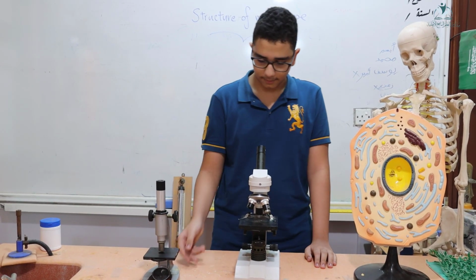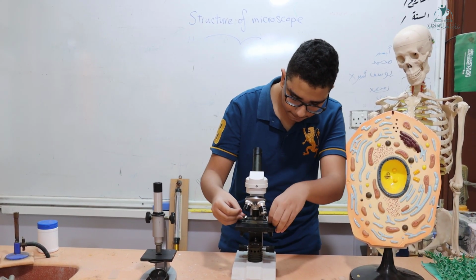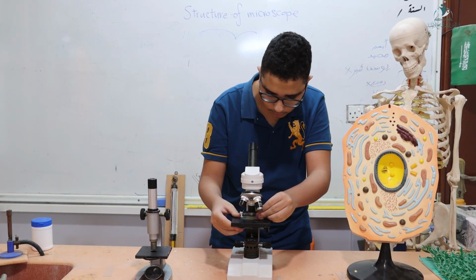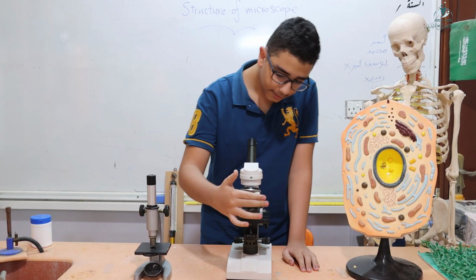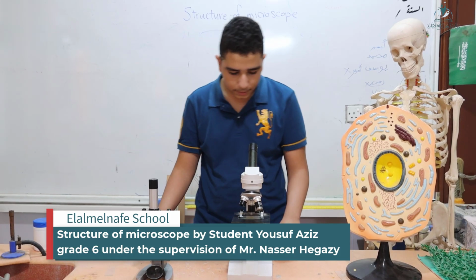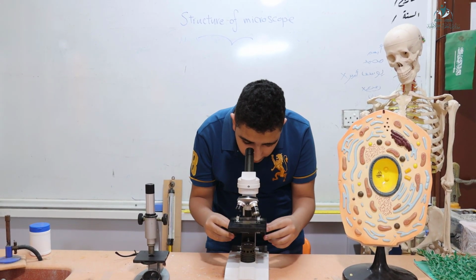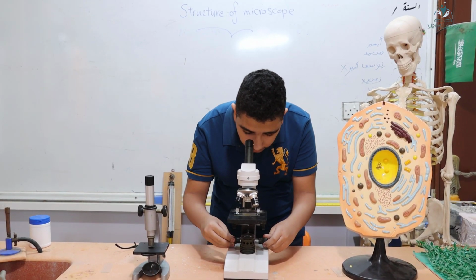Now let's use it. We first put the slide in, then fix it with the stage clips. Then we can use different objective lenses. Then we can look at the sample, and if it's not clear, we can use the coarse focus or the fine focus.